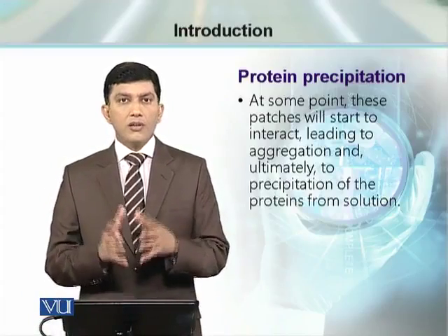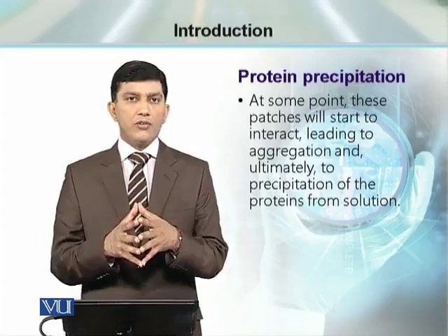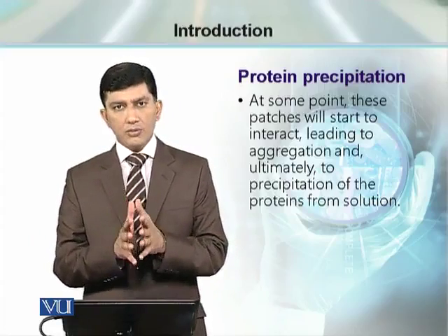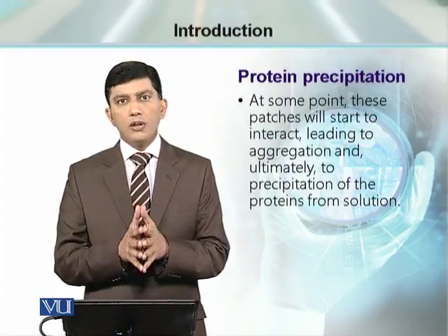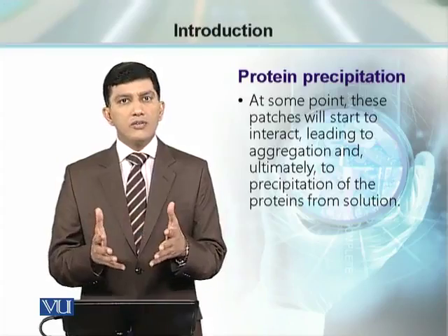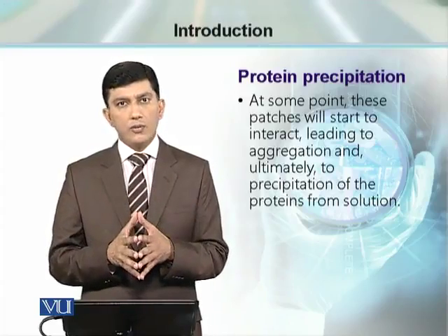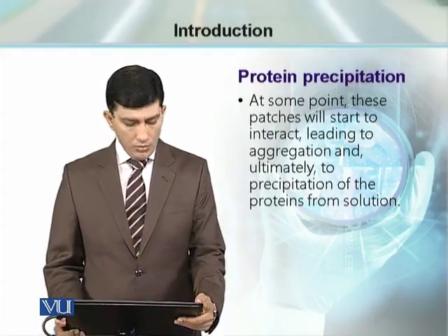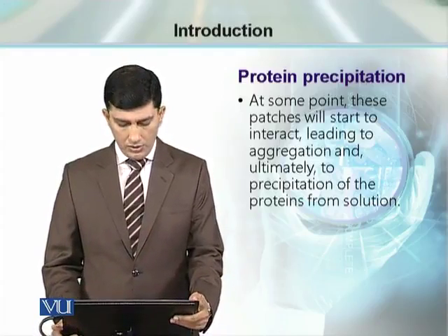इस सारे प्रोसेस में जब हमारे पास इंटरेक्शन के बाद प्रोटीन प्रेसिपिटेट करती है, then we have maximum protein in the form of precipitate, and the upper aqueous phase contains this high salt concentration of ammonium sulfate and the water, which we can easily remove from the separation.